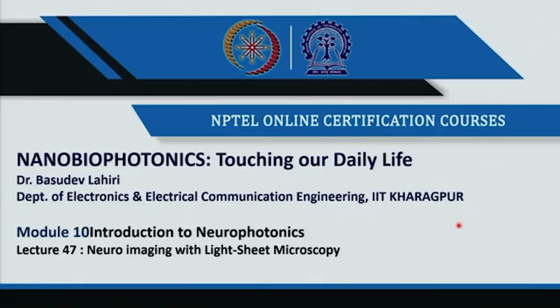Welcome back. We are continuing our discussion on neurophotonics, and today I have another topic for you, and that is neuroimaging with light sheet microscopy. It is also sometimes used as LSM, but LSM has other connotations, especially in life science. Laser scanning microscopy is also called LSM. So, this is usually LSFM, but overall we are going to discuss light sheet microscopy, not laser scanning microscopy.